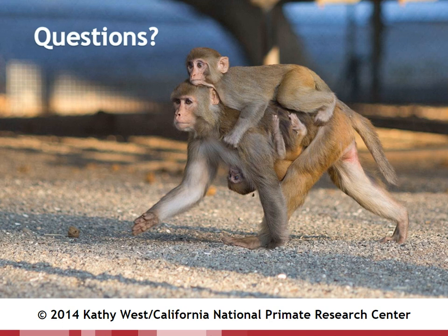I think another important thing to do is look at chronic effects, because we have an interest in the lab in looking at development of tolerance and dependence with chronic benzodiazepine treatments, what these chronic treatments do to EEG signatures, and how that can predict behavioral effects as well. So that's another way that we're planning on going. And finally, specifically for using EEG, our laboratory focuses on studying the abuse liability of drugs. So we're also looking at the effects of other drugs of abuse using EEG during the daytime, and also the effects of these drugs on sleep-wake cycles, which is another way that we're going with this research line.